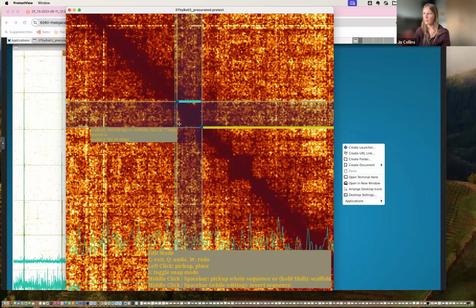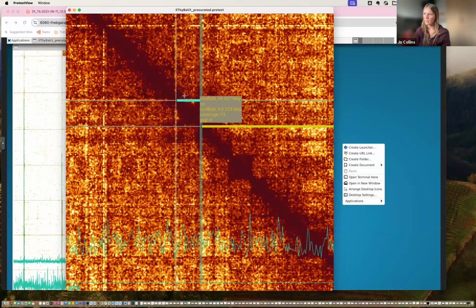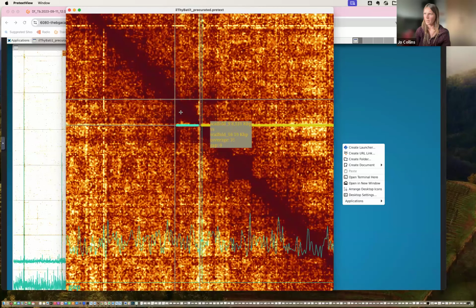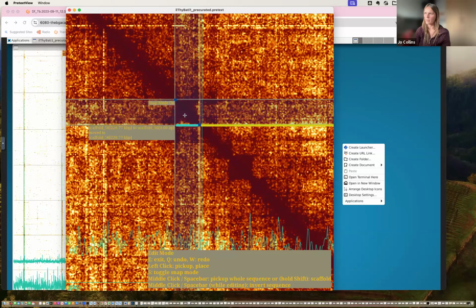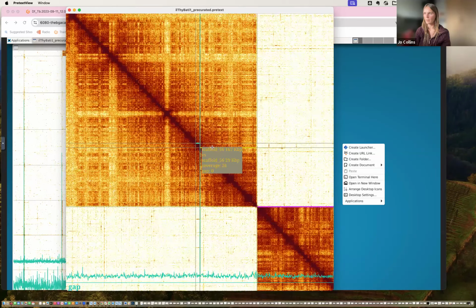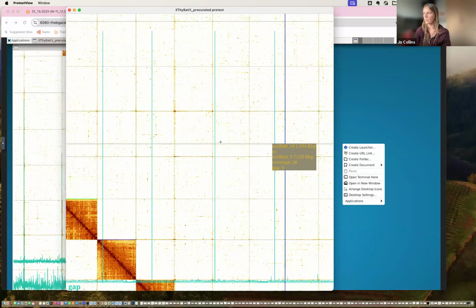And you can see again that the strongest match, although it's not quite as clear as in the other one because there is a sort of high affinity on both ends of this chromosome. But this actually has the strongest match. If I flip it the other way, you can see that actually it looked better before. So that tells us that our piece is assembled correctly within the chromosome. We'll go back.